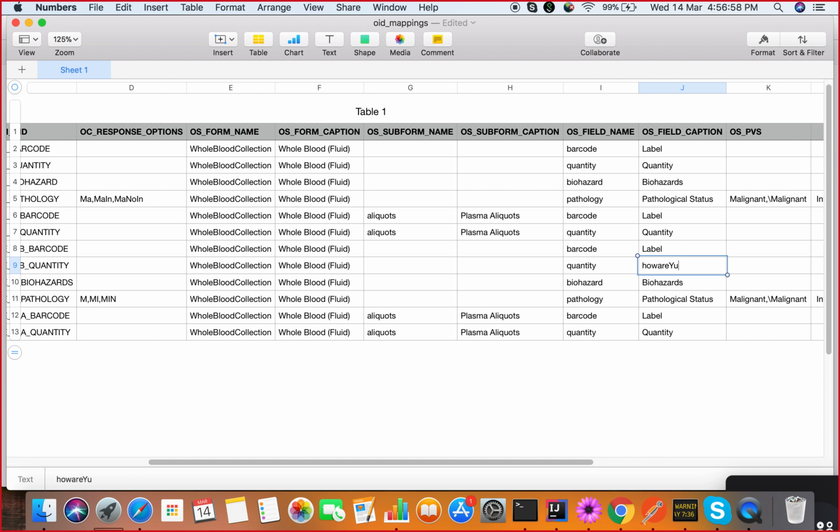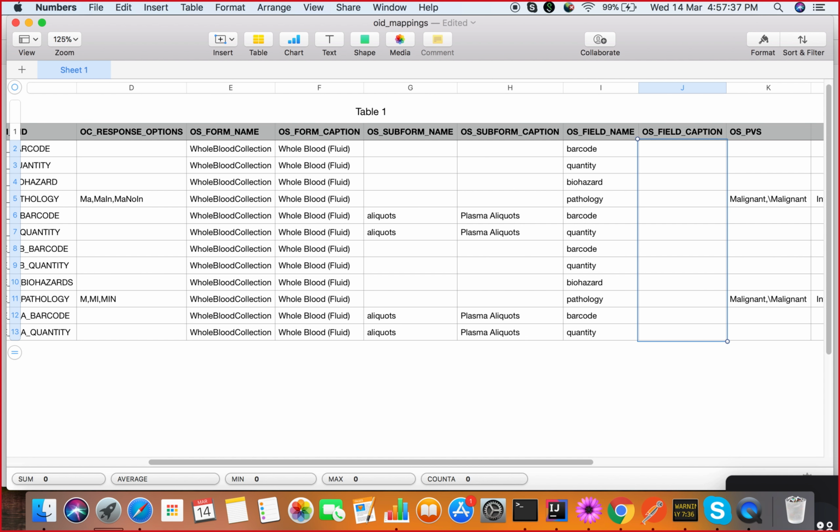Yeah. But in OpenClinica, that's not the OS OID. In OpenClinica, that's the left item text, which you don't retrieve it from. Yeah, so you can consider this as the left item text actually. So for all practical purposes, this is not a name. This is the left item text, for your understanding. Then you could easily retrieve that as well from OpenClinica. Yeah, exactly. If you remove everything, then we will copy whatever was the left item text in OpenClinica.